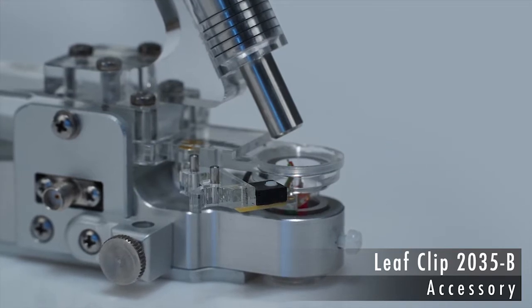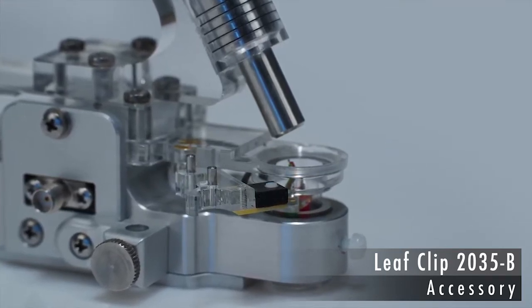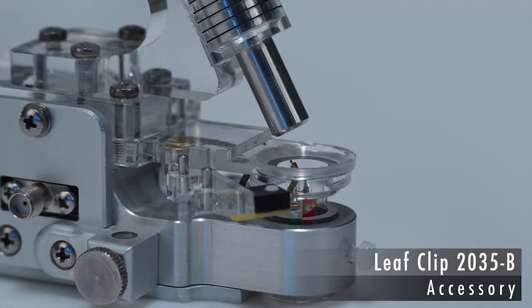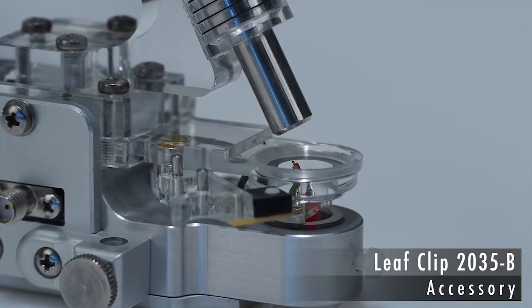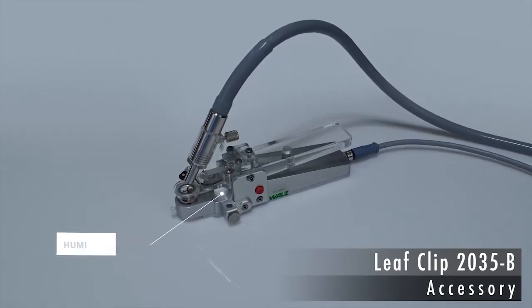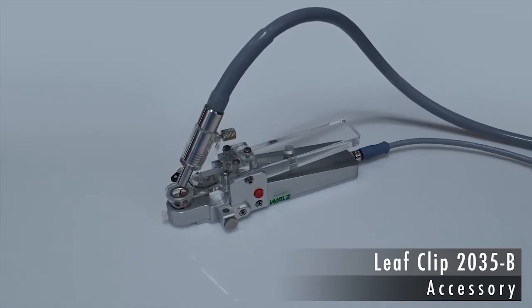The photosynthetic electron transport rate can be derived from both the PAR and Photosystem II performance. At the same time, the temperature of the leaf is measured using a thermocouple. The field clip also features a humidity sensor to monitor air moisture, which affects leaf photosynthesis by modulating stomatal opening.